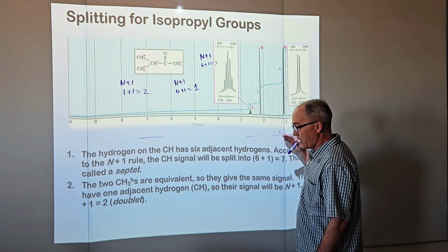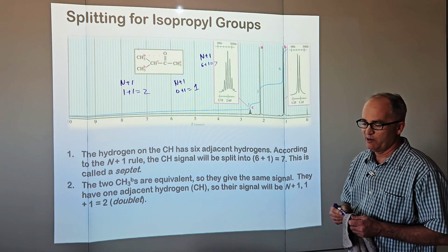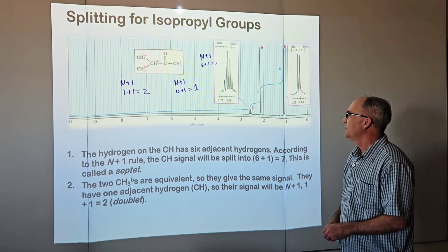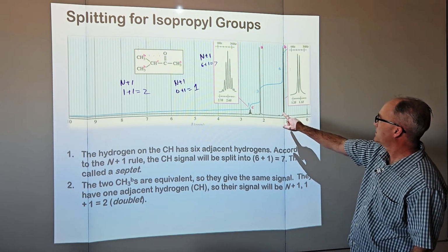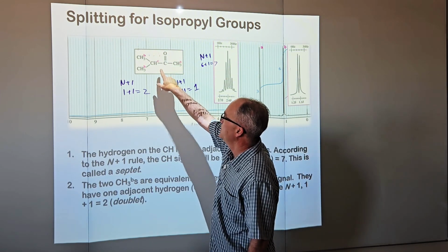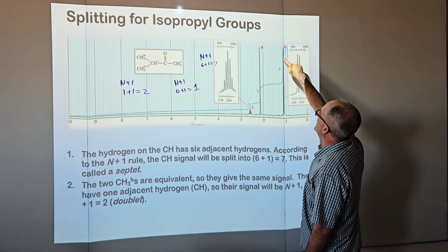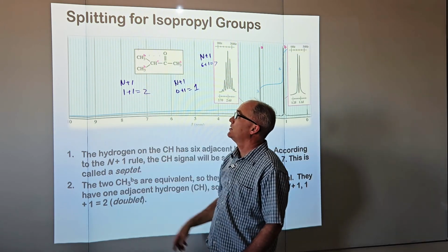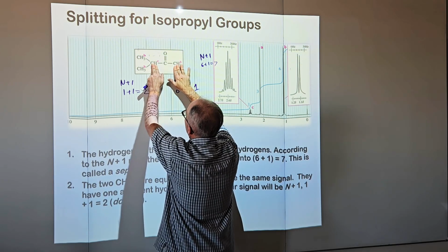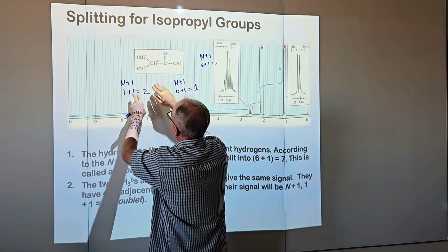Any questions? Right, how shielded they are, whether they're upfield or downfield. If on a quiz you put it in the wrong spot, you wouldn't get marked off. Yeah, the 1, 3, 6. Right, so this is the integration. This peak integrates to 1. This peak integrates to 3, that's the singlet. And this 6 here gives you these. So to answer Tianya's question, these here are both kind of deshielded by this oxygen. I'm going to put them a little left.